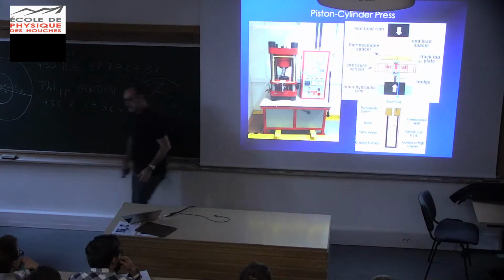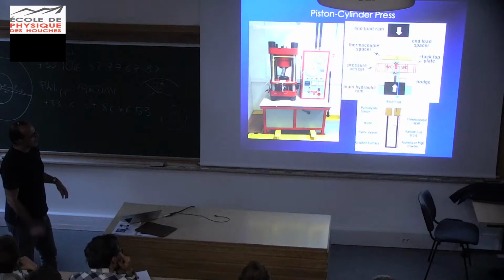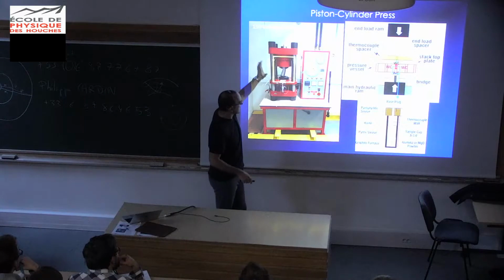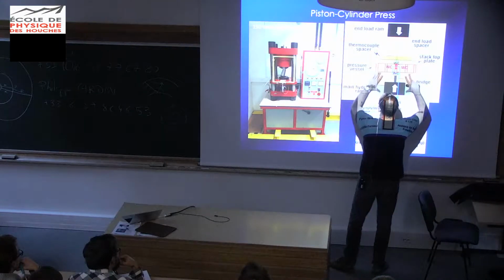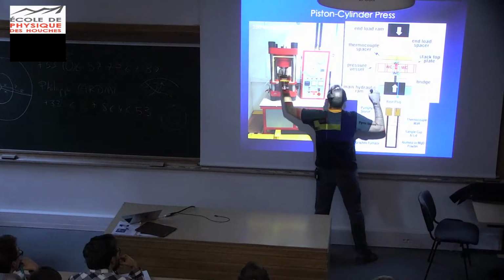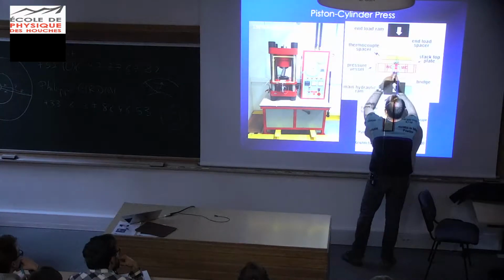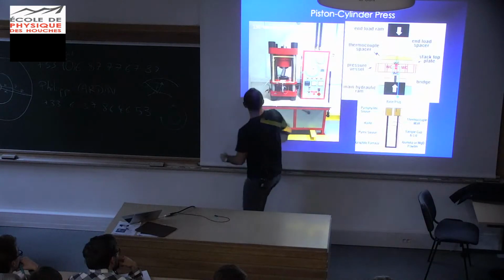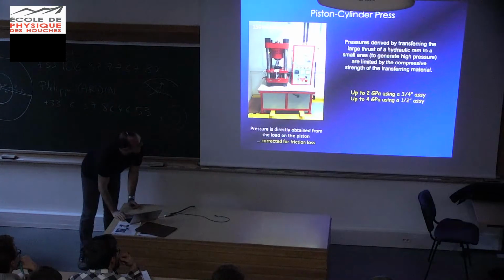Just to be clear, the picture on the left here is actually when there's no sample, it's open. If I showed you with a sample, you wouldn't see anything. So there's no sample. When you have the sample, the only thing you would see on top is this thing, right? And you have this, and this is basically a pressure plate on top so that the sample doesn't ooze out. So you would have a big disc sitting here, that's it. And the gap would be closed. Okay?